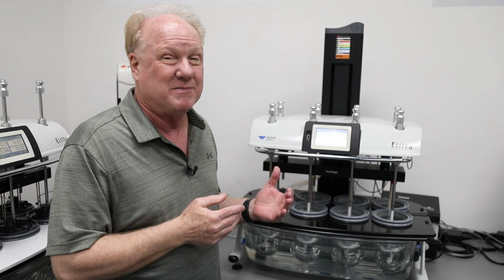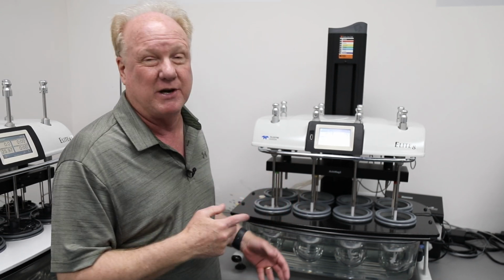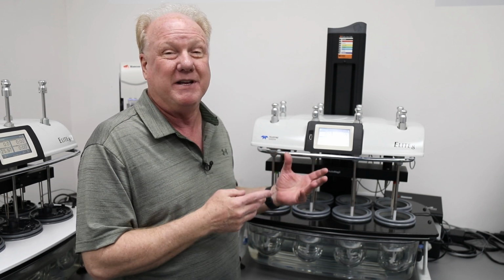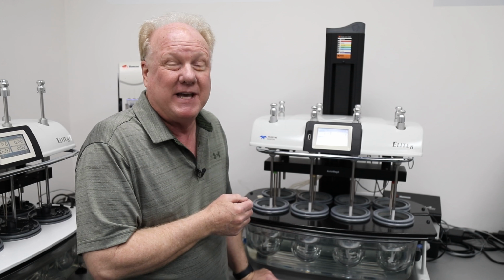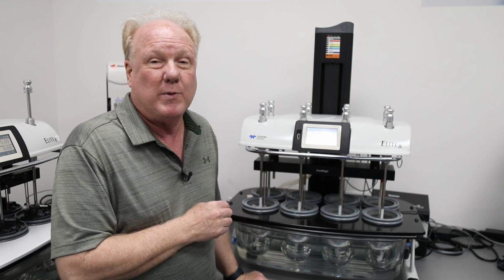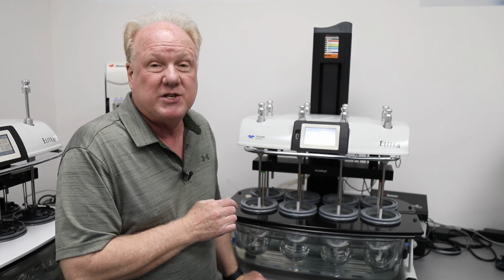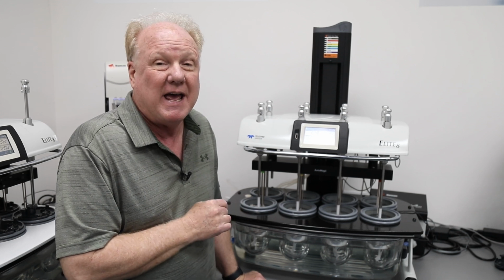It can vary from sample to sample and application to application. We're going to have some applications that are very robust, and the level of gases dissolved in the media aren't going to have a significant effect. We may have other applications where that level can affect our results. So it's important that we have a procedure in which we have confidence that we're reaching a significant level of degas. The USP compendial procedure has a published degas procedure using heated solvent and vacuum.